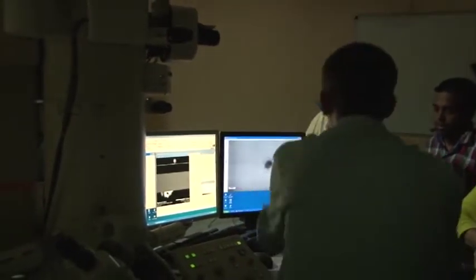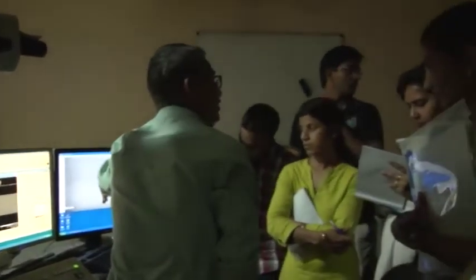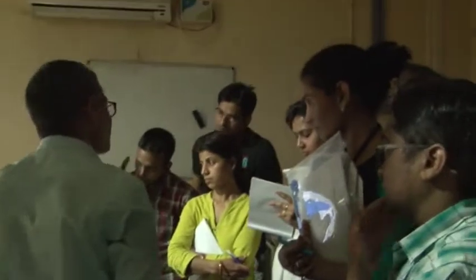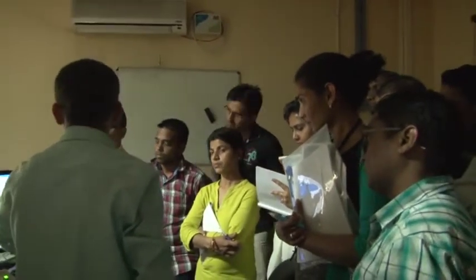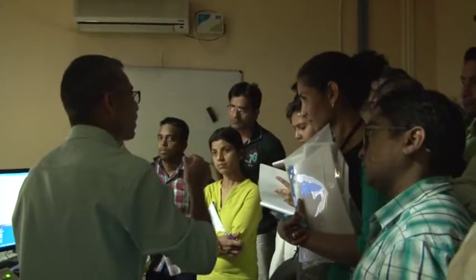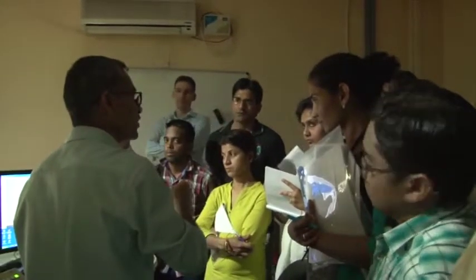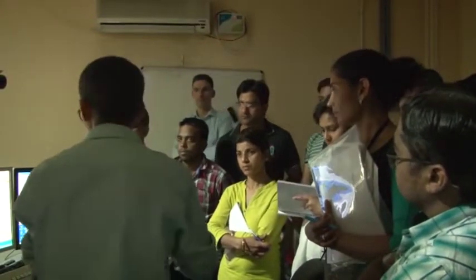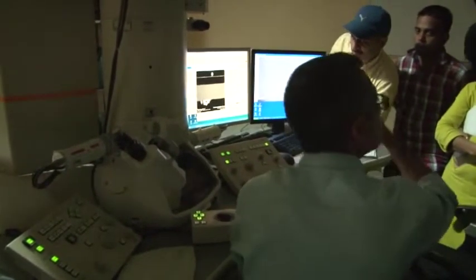And you see, if there is some asymmetry in this fringe, if this Fresnel fringe is not homogeneous, that is an indication that there is objective astigmatism in it. The fringe being there is an indication that there is some defocus. But inhomogeneity in the fringe is an indication that there is objective astigmatism. And that can also be corrected. Now let's quickly see the effect of defocus also.